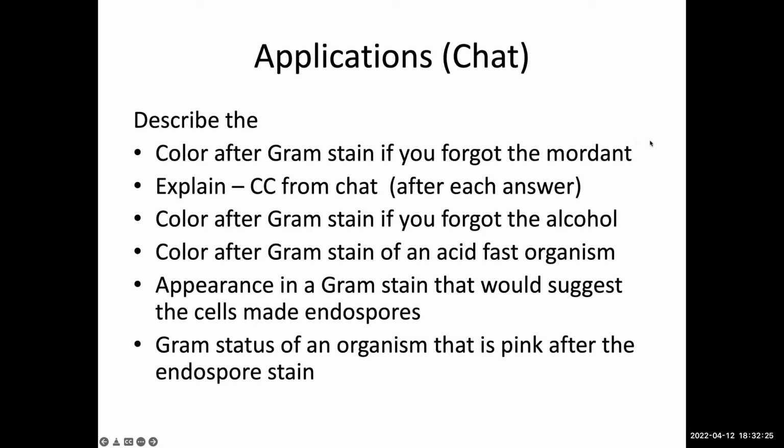Sure. So I was just looking back at the two-step for the endospore stain, and I know that the safranin, that counterstain, causes the other cells to go pink. And so that's why that would be the result, but not necessarily a gram negative status or anything like that.